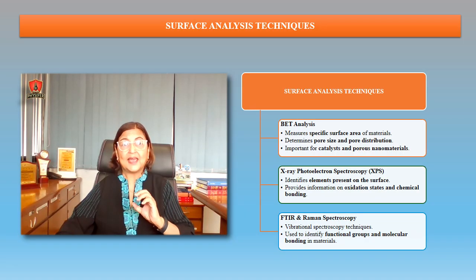Third is FTIR and Raman spectroscopy. Both the techniques are vibrational spectroscopy techniques that identify functional groups and molecular bonding in the sample material.